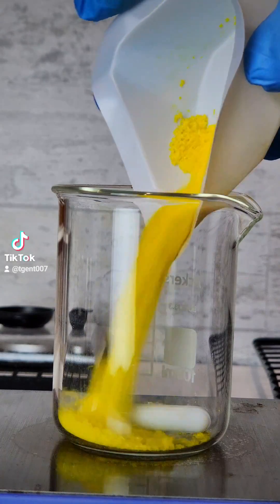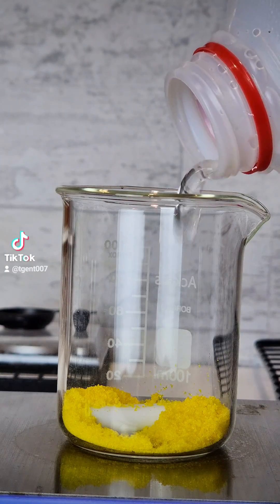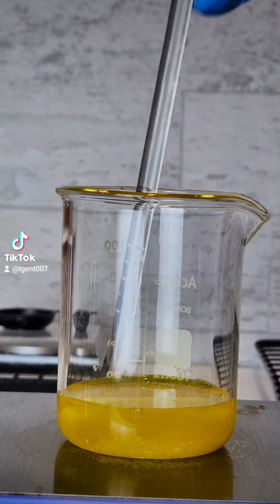While the lead is cooling, I need to make my sodium dichromate into a solution. Take extreme precaution when doing work with chromates, as they are all highly toxic and carcinogenic.